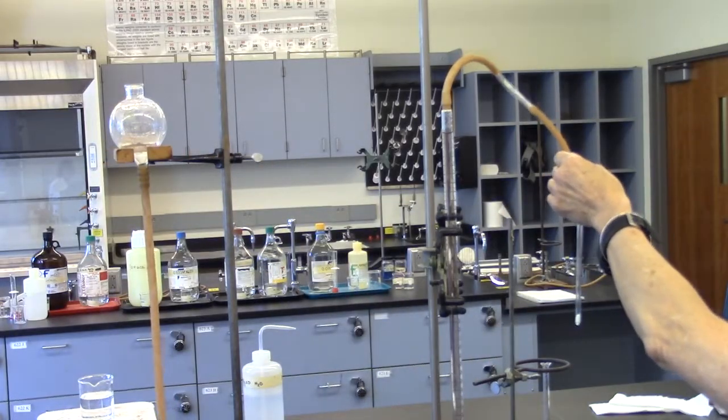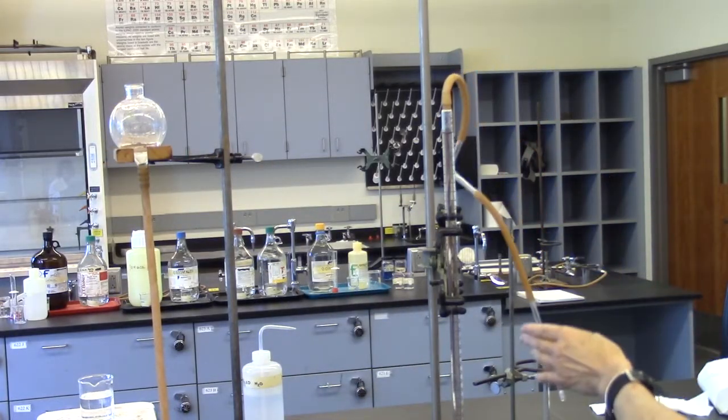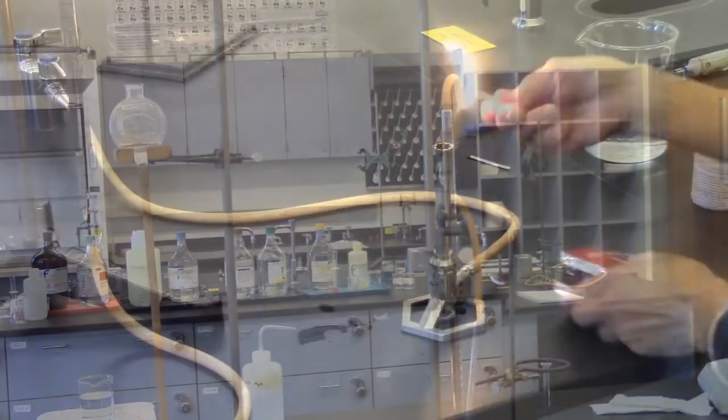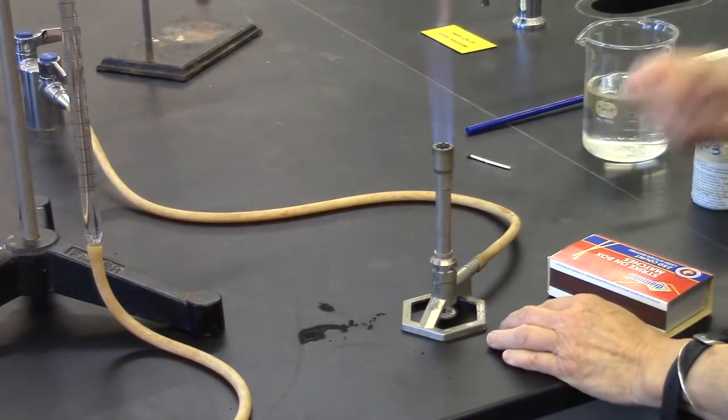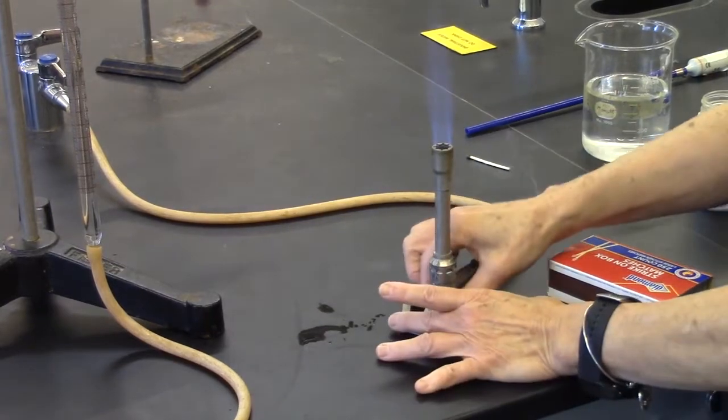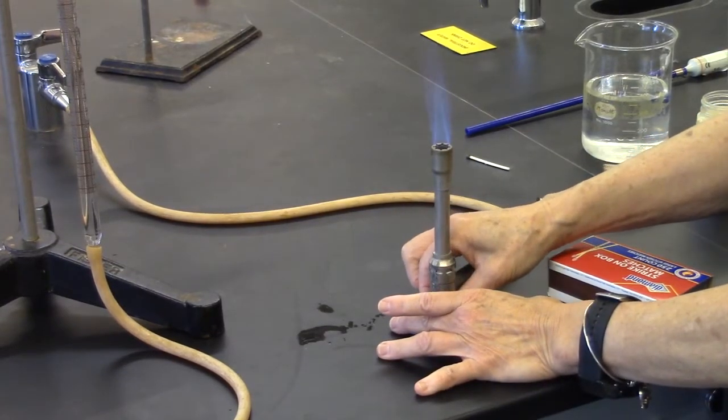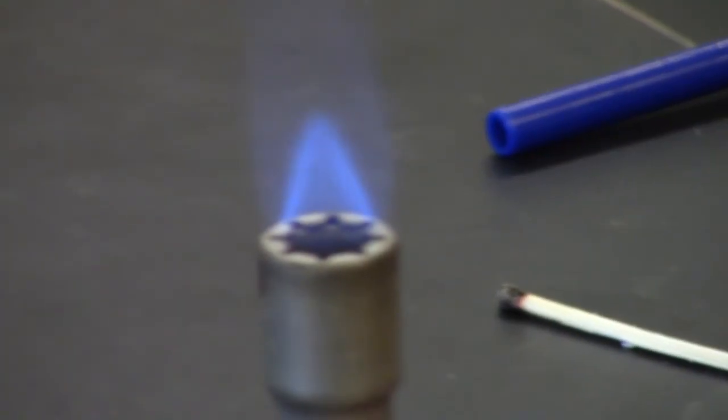Before heating, take a look to see that the funnel support and burette holder will not be in the way. Light the Bunsen burner. A small hot flame will do. Remember, the tip of the inner cone is the hottest part of the flame.